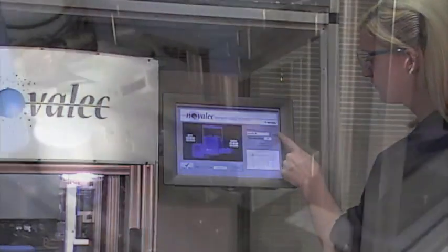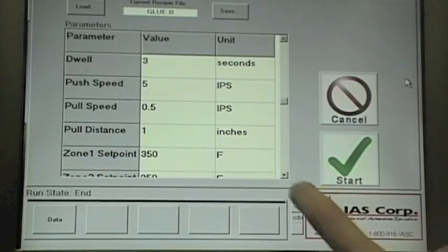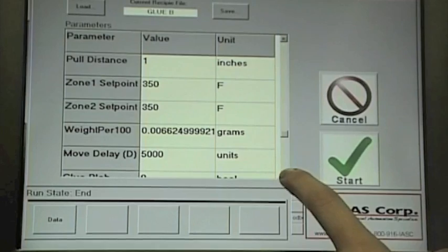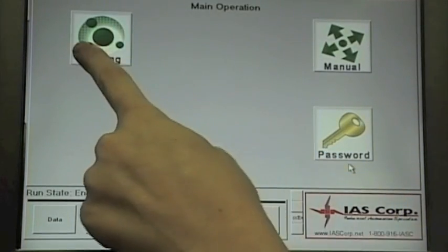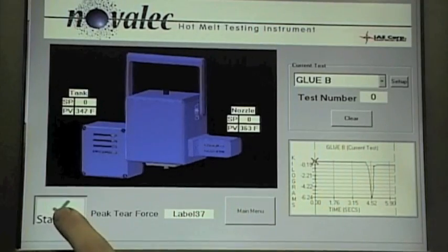Novelec provides different options for setting up the parameters of each test. It can measure the amount of glue being dispensed and achieves more consistent results and higher accuracy using low amounts of compound.